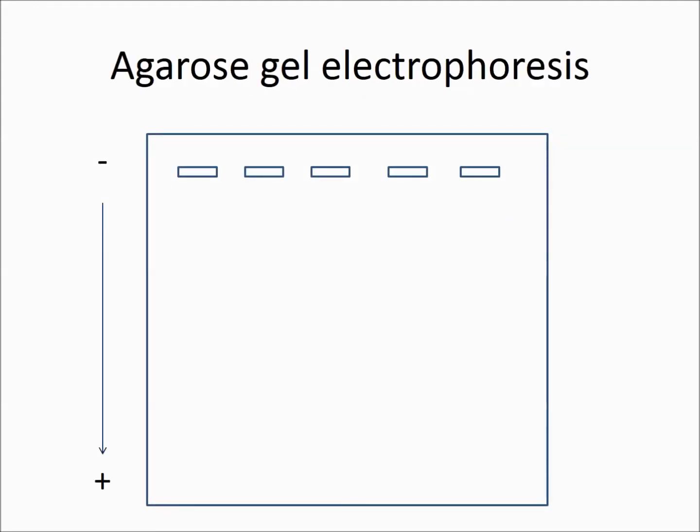Okay, now let's explain the agarose gel electrophoresis technique. Visualize the agarose gel as being a slab of jello that is about 1 centimeter thick and has the shape of a rectangle. At one end of this slab, a series of wells are made and circled here, and it's in those wells, in those indentations in the slab of jello or agarose gel, that the DNA sample containing all those target sequences after PCR will be added, will be loaded.